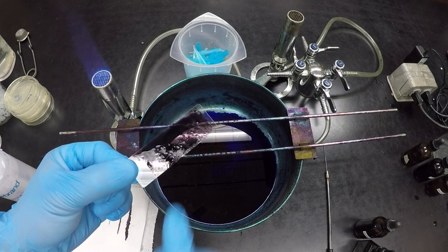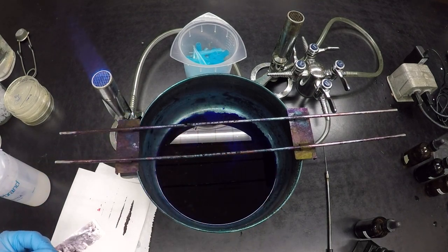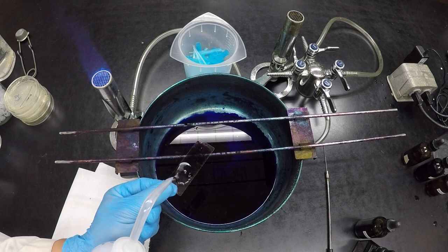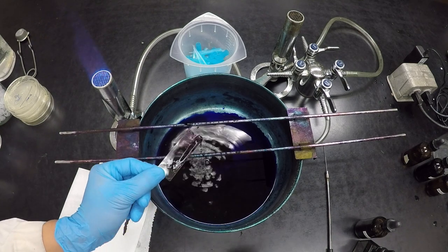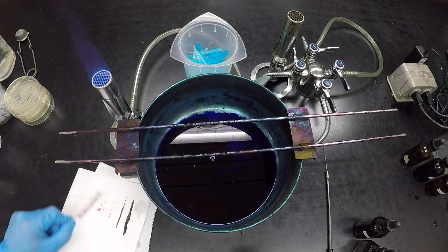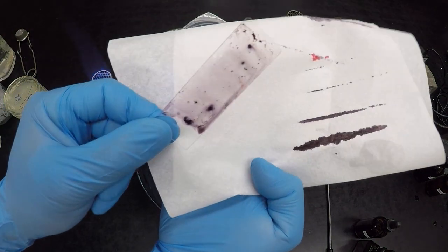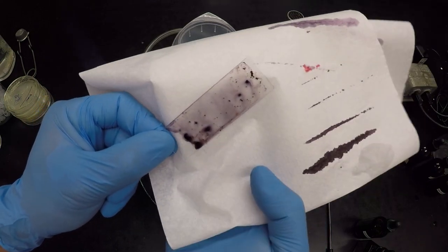And you want to see blackness, okay? If you see no blackness, can you guys see that? Then it's not very good, right? So what some people do is they do rinse very gently. It's got to be a very gentle rinse. And part of the problem here, by the way, is I never let it air dry. But you see after this procedure, you see something like that, where I've washed off most of the ink. That means it may not turn out very well. But you take a look anyways, there's still some ink on there.